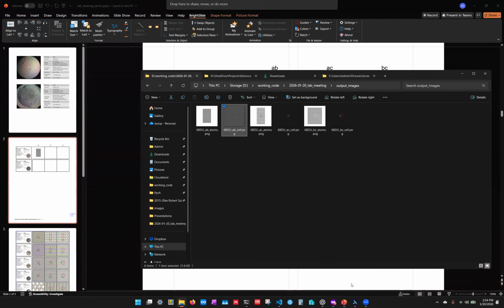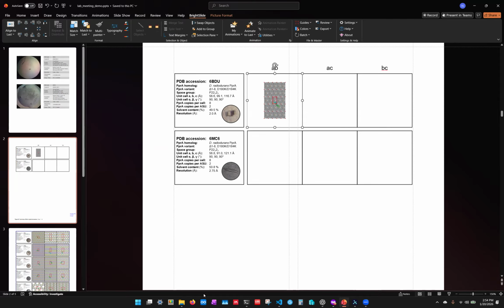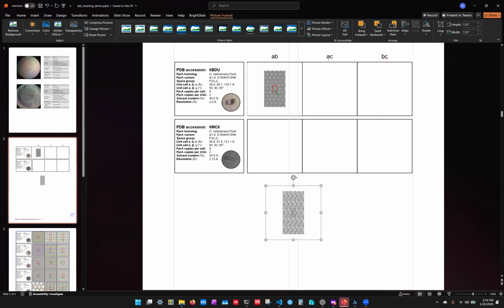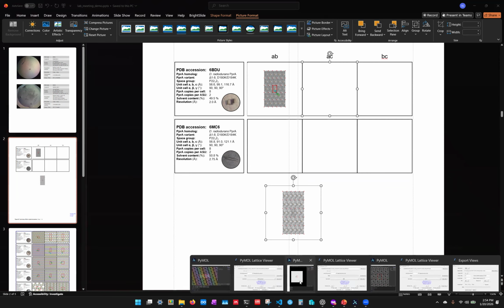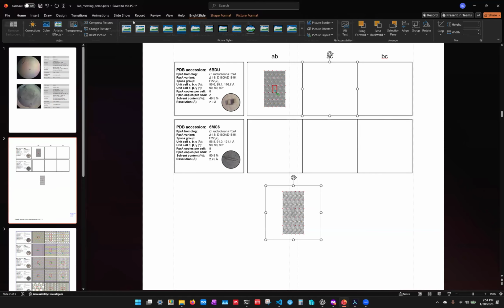Okay. So the fact that the lattice is the same between the two, but the asymmetric unit is different, is based off of how the crystal was mathematically solved. Yeah, this was an arbitrary choice by whoever was solving the crystal structure. It's not like Phoenix automatically selects.